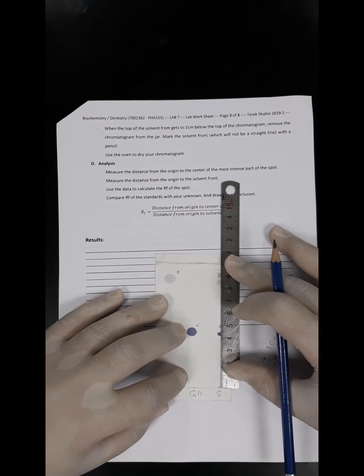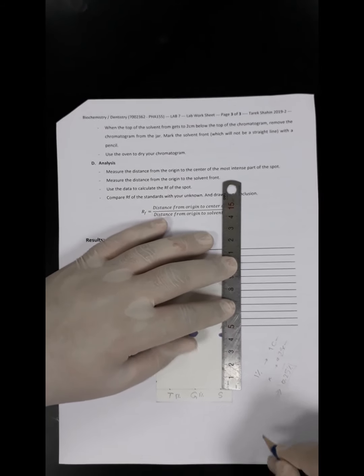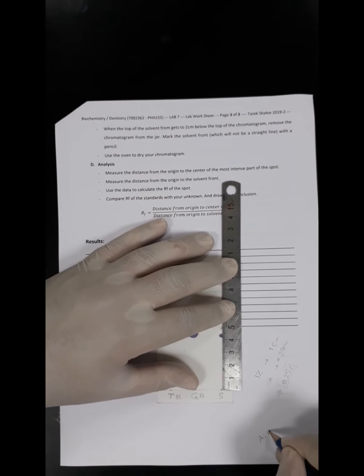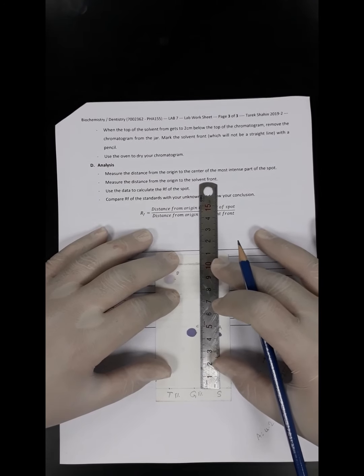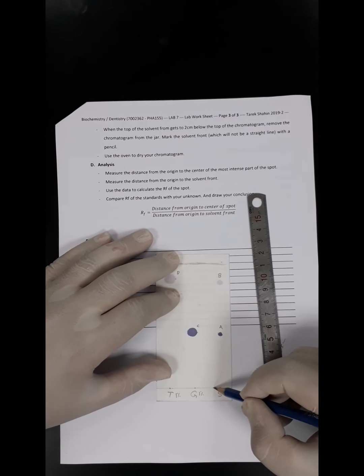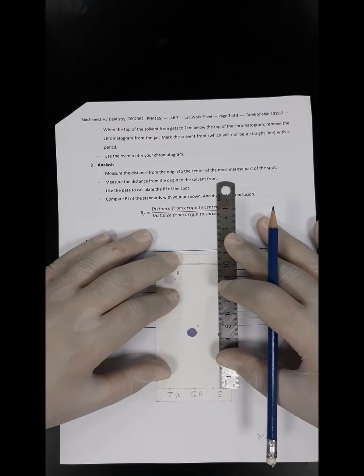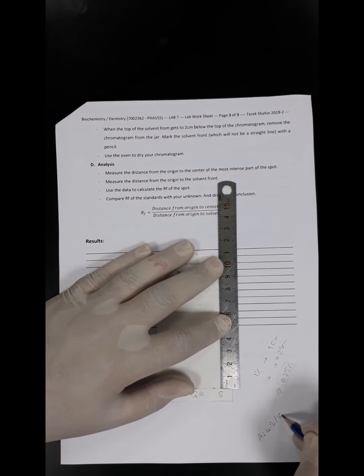I'm going to use the ruler in the right orientation. So it would be around 4.2. So for spot A, it's 4.2. Let's calculate the overall distance traveled by the solvent front, which is the distance from the start line to the solvent front. Let's measure it. It would be from here to there, which is 10 centimeters. So it would be over 10 centimeters.